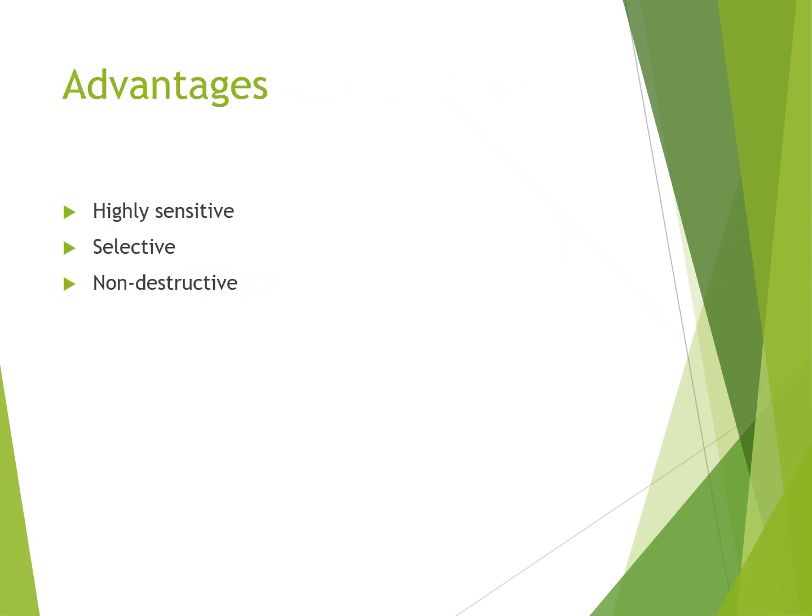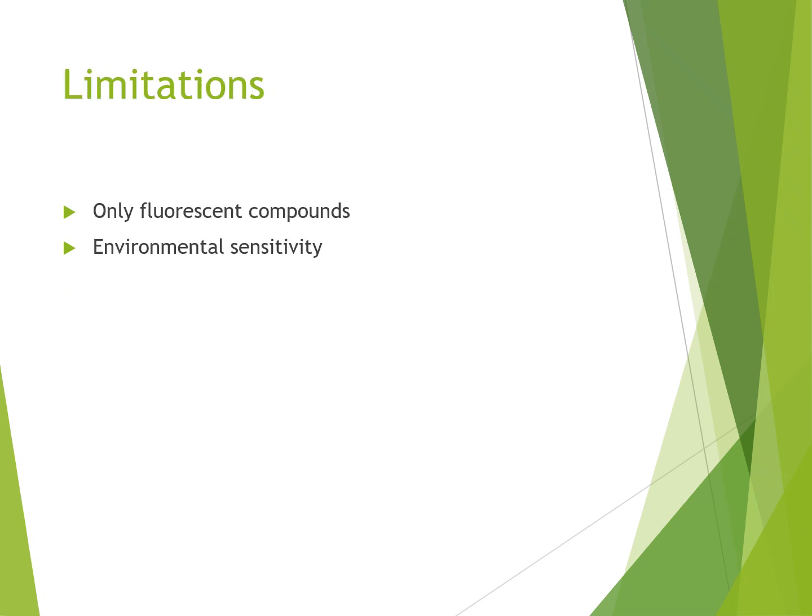It has various advantages, including high sensitivity and selectivity. It is non-destructive in nature, as it doesn't cause destruction. It is very selective and has very high sensitivity. It can measure low concentrations. So it is very sensitive and selective.